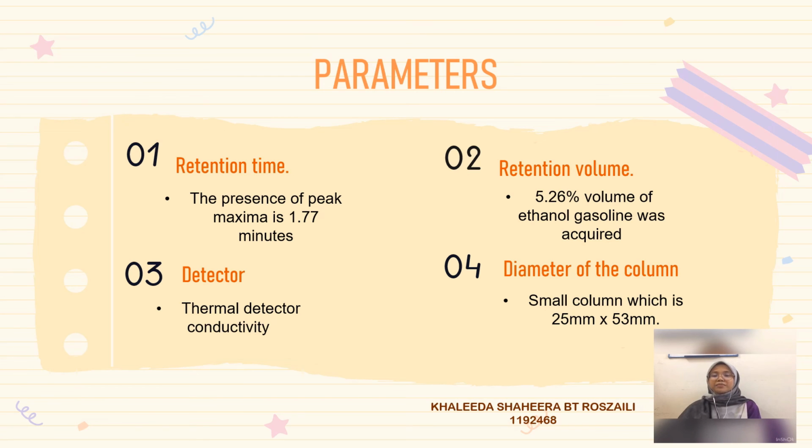The third parameter is the detector. The detector used is a thermal conductivity detector. Lastly, a small column was used with a diameter of only 25 mm times 53 mm.